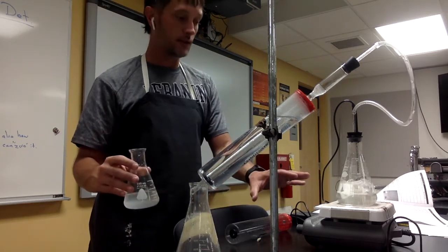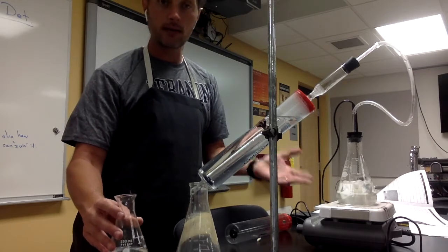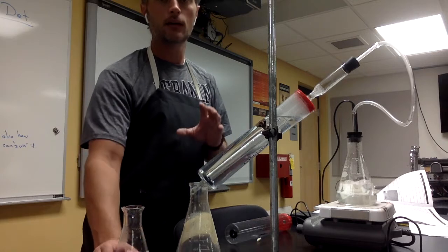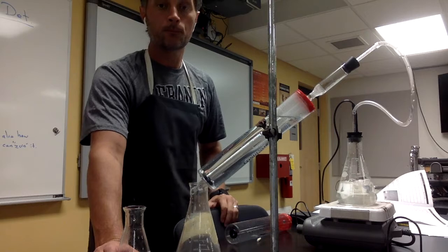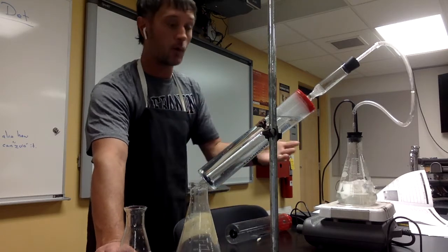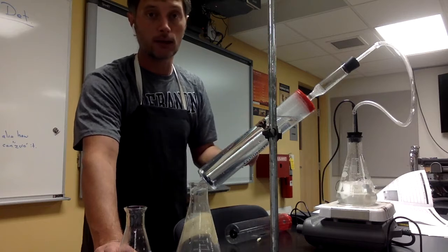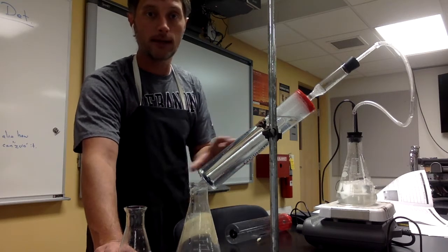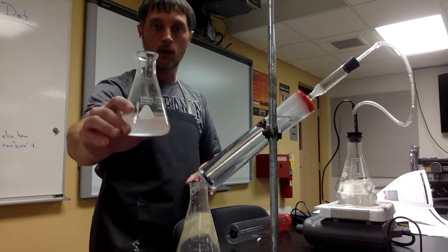So I'm going to finish this. I'll take it all the way to evaporated, and I will post the data. You'll see a graph on your student sheet for you to fill out. And hopefully you know enough about this distillation process that you could do it again. And definitely you know enough that if I provide you sample data, you could distinguish, okay, I've got this thing.